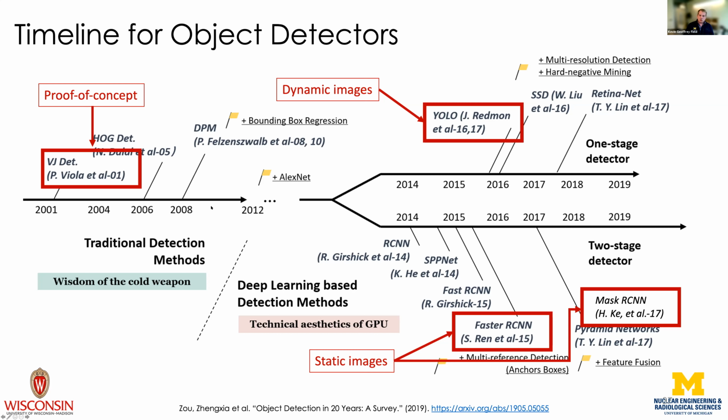So I was sitting in this regime. But in 2014, we saw this evolution to these deep learning based detection methods, right? So these convolutional neural networks, these are the things that are driving Teslas nowadays, self-driving cars, your Face ID on an iPhone, if you have one of those and you're not an Android user, is using these types of detection methods. These have revolutionized the way we can do detection, classification of features in an image.